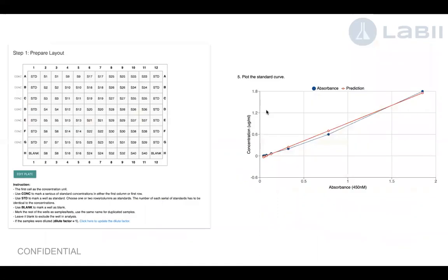And then it will just look like this. In a particular section, you can just paste the layout, paste the values, and click analysis. It will give you the final result directly inside the system. So that's one other use.